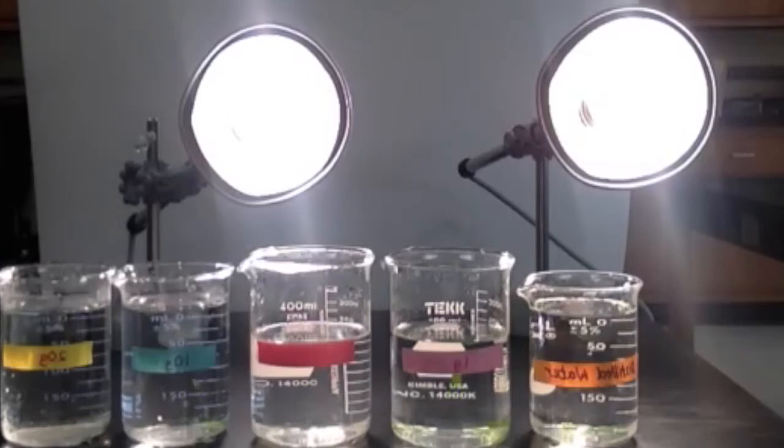Sources of error include droplets of solution spilled while removing gas from the leaves using syringes, the slightly wilted condition of the spinach leaves, and small differences in the position of the light source. This experiment could have been improved if all the spinach leaves were in healthy condition and the observation was extended over a longer period of time.